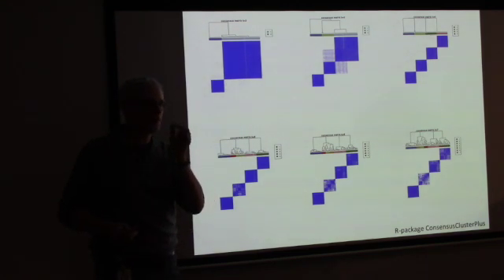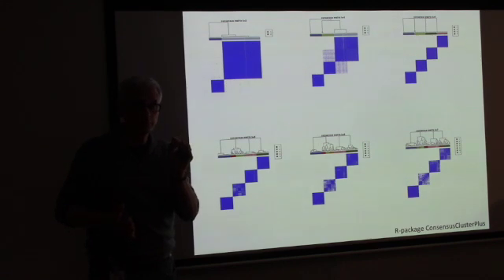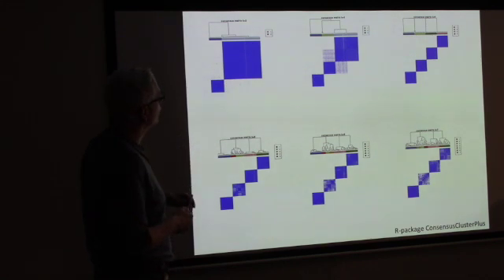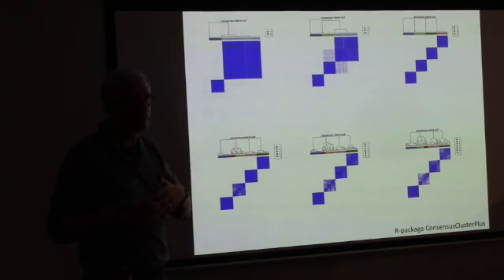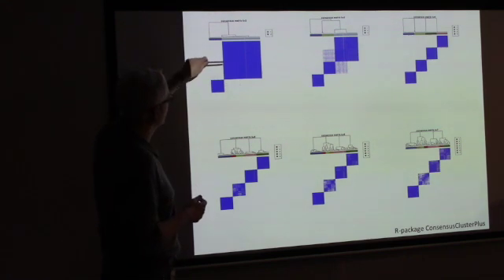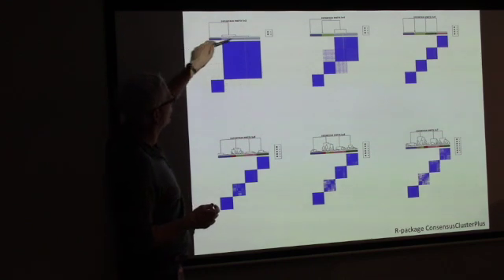What fraction of the time, when sample 1 and sample 2 are not both discarded, are they in the same cluster? If that fraction is near 1, if they're almost always in the same cluster, we make it blue. If it's near 0, we make it white.